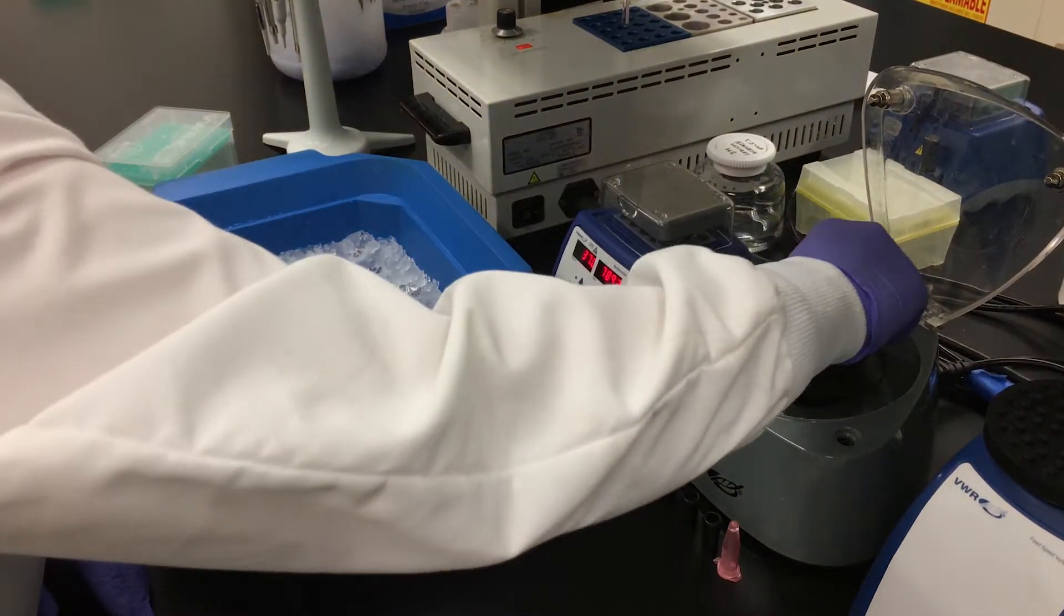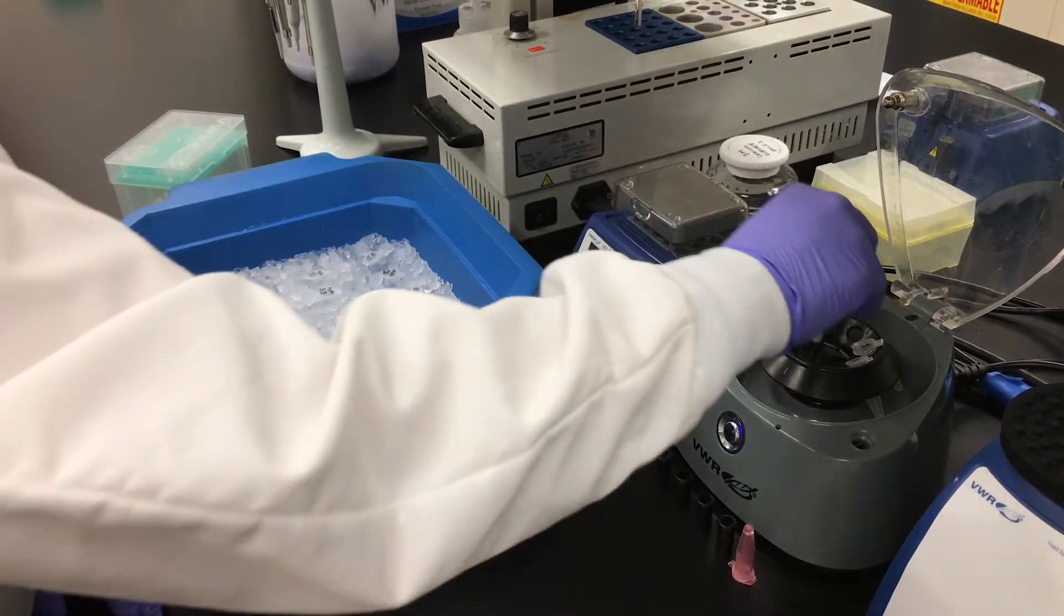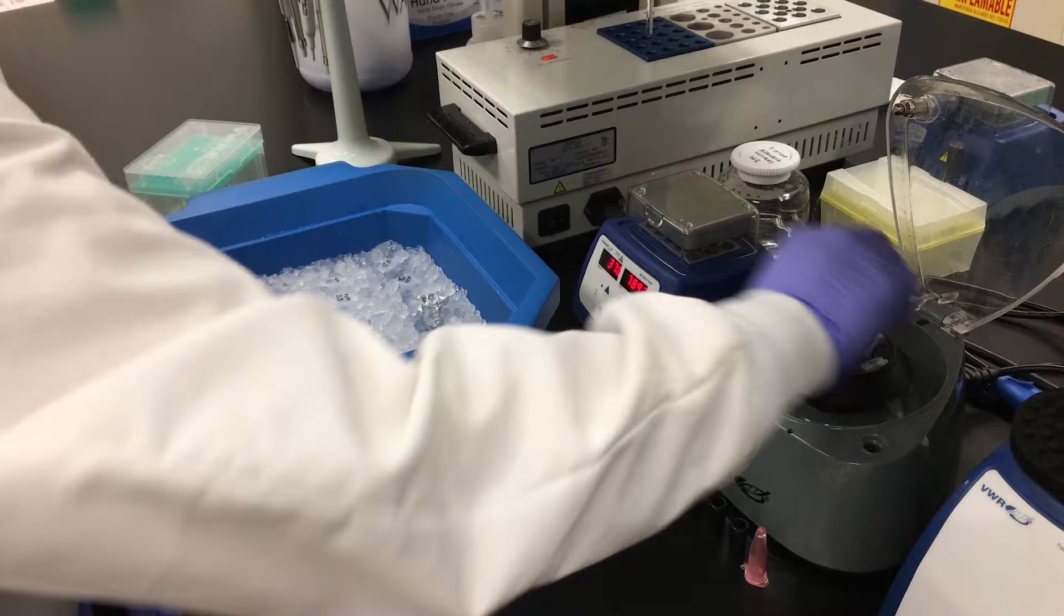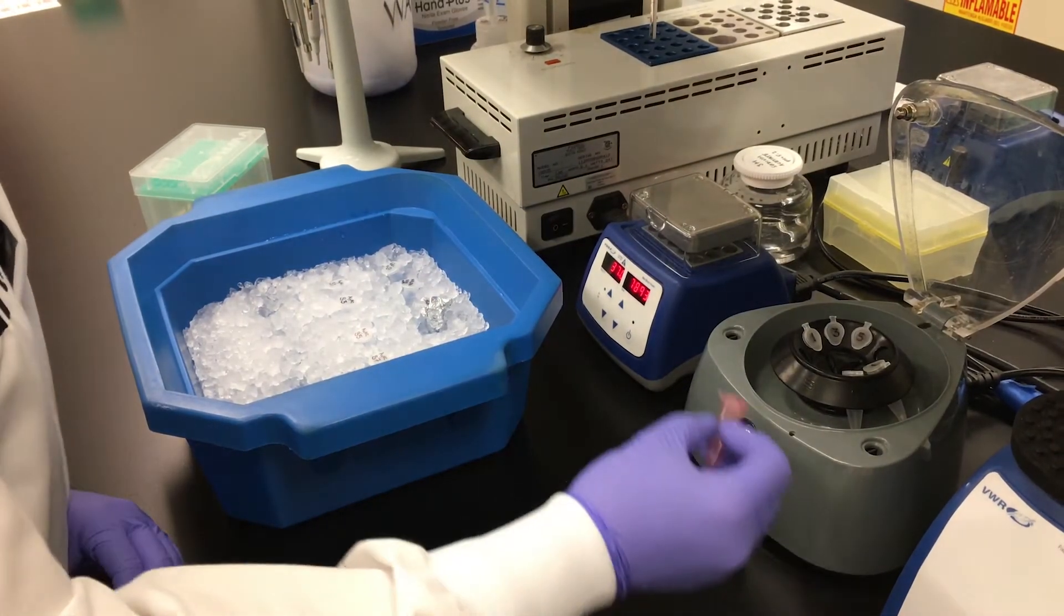The samples are then briefly centrifuged to ensure that any liquid that is stuck to the walls or lid of the tube is brought down to the bottom. If you have an odd number of samples, be careful to balance your centrifuge before spinning.